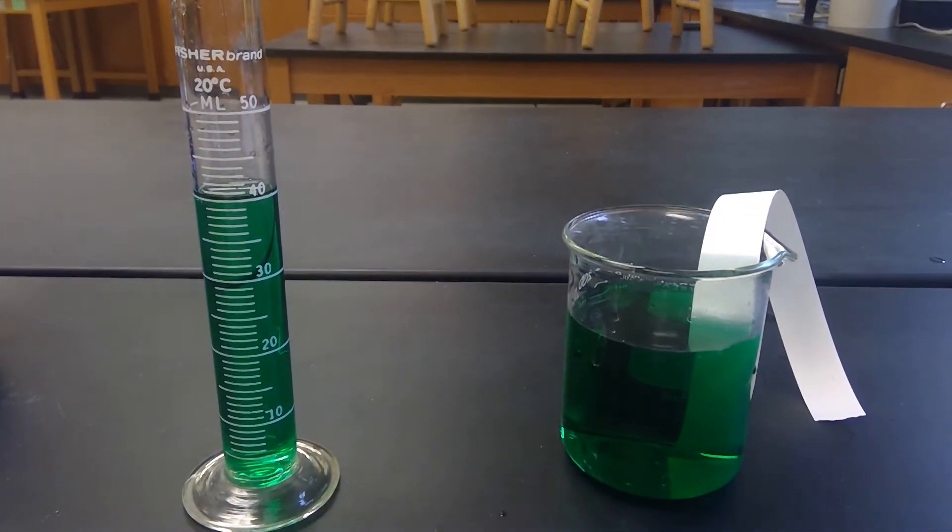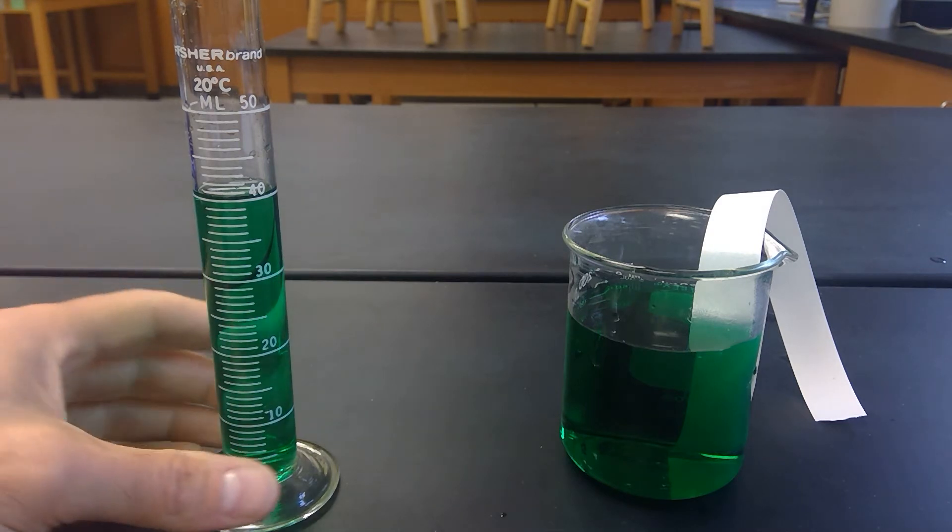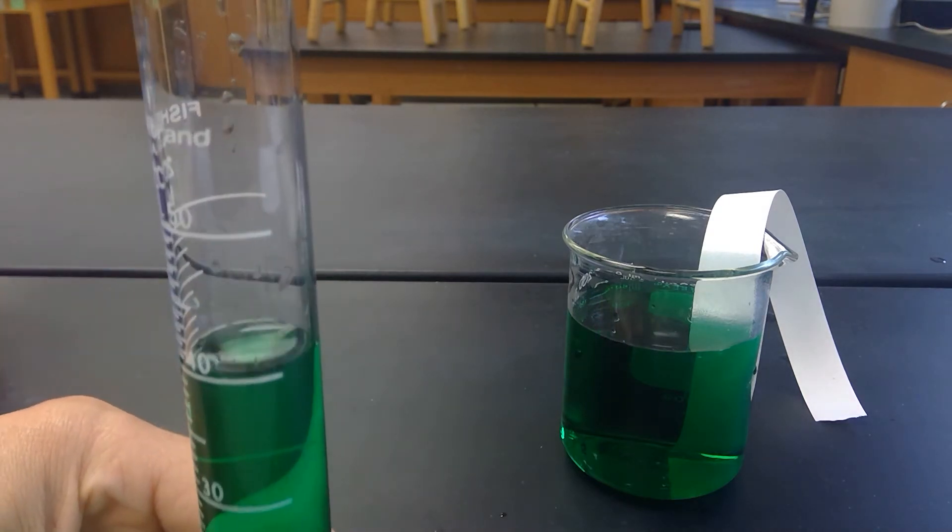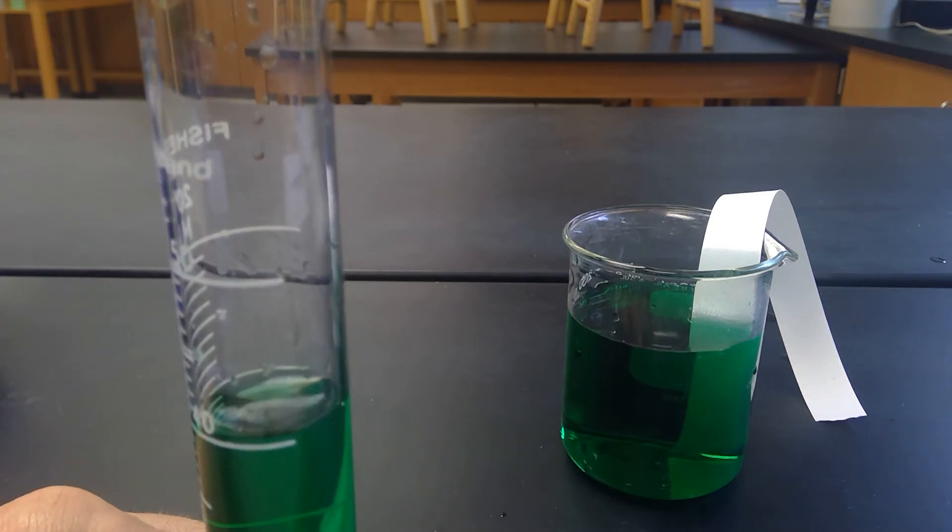Okay. So that's part A. For part B, we want to look at this graduated cylinder. And if you look at it very closely, you'll see that the surface of the water actually goes up a little bit along the edges. That's referred to as a meniscus and I'm actually going to make my camera go down.